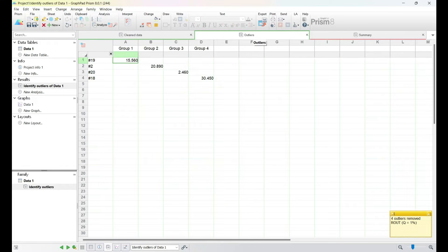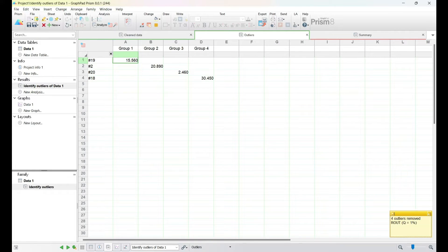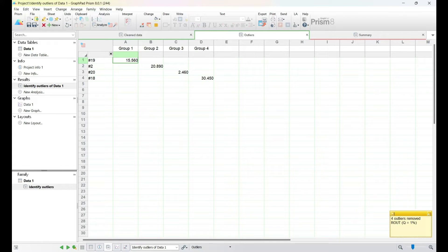Removing outliers can be a delicate process, and GraphPad Prism provides a user-friendly interface to help you make informed decisions while maintaining the integrity of your data set.